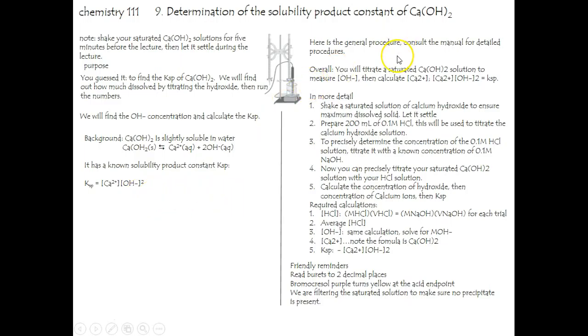Here's the general procedure. Compared to the procedures I've been giving you before, I'm getting a little more generalized because we've done a lot of titrations now, and some of this should be fairly straightforward. I hope I don't have to mention anything about preparing the burette or any of the general techniques that we've been using. So here's the general procedure. Consult the manual for the detailed procedure.